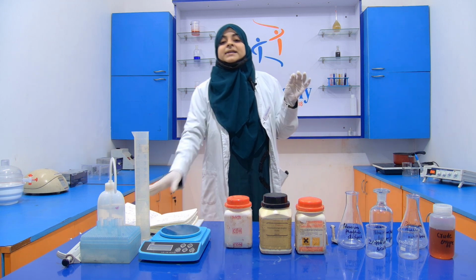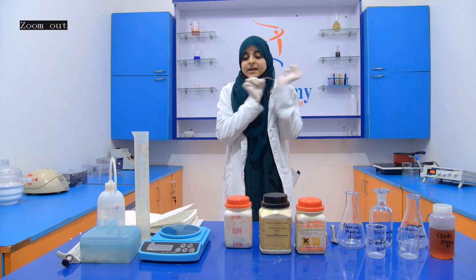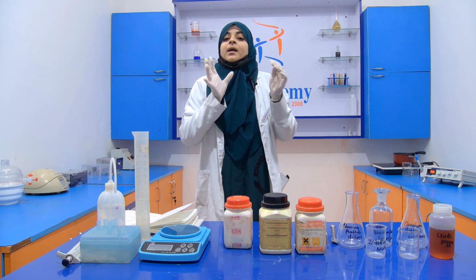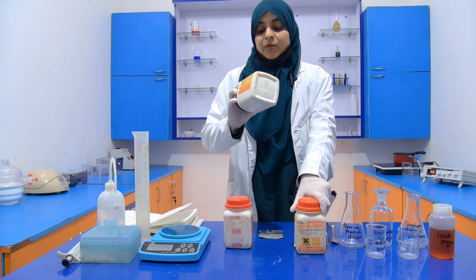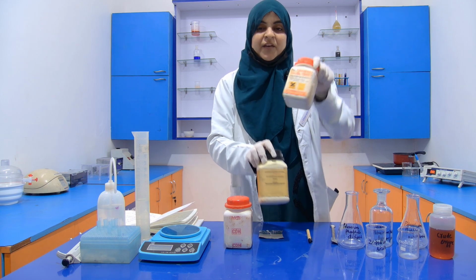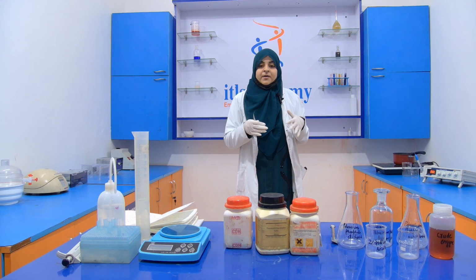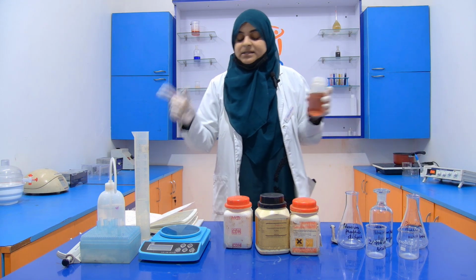So for the dialysis of the protein, we first require a dialysis membrane and sodium bicarbonate. Sodium bicarbonate is required for the activation of the membrane. Then we require potassium phosphate monobasic and potassium phosphate dibasic. With the help of these monobasic and dibasic salts, we prepare a potassium phosphate buffer. We also require crude enzyme and distilled water.